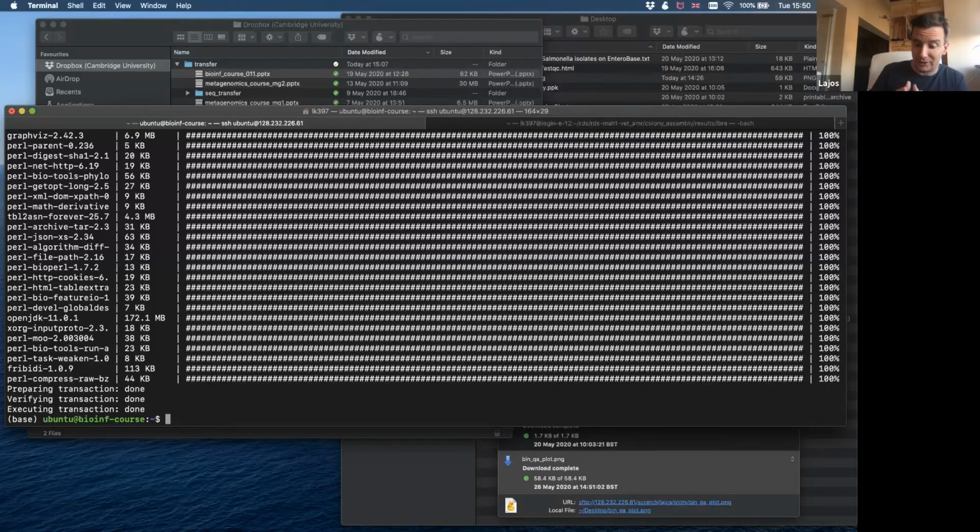So that's one of your reasons why you want to do a prokaryotic genome annotation.